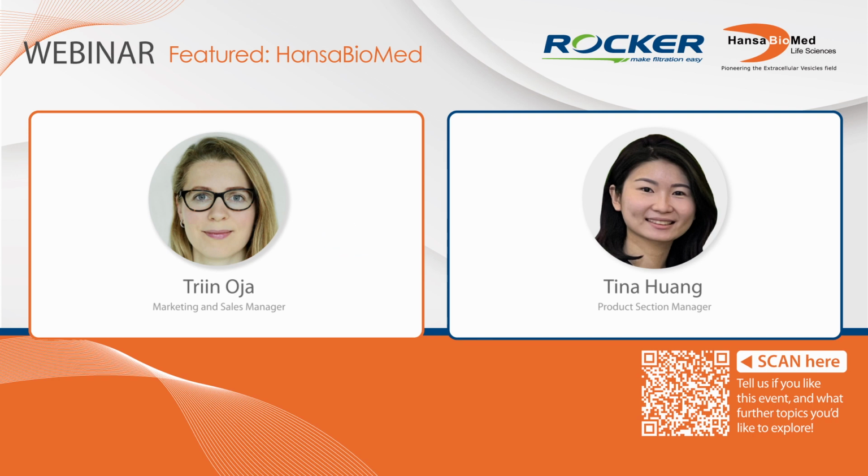Okay, yes. Thanks. And the other question is about the new gold standard being TFF combined with SEC, right? My question is, I use the TFF to remove the large particles, large vesicles, and then concentrate to the needed quantity, and then put it into the SEC, right? Did you compare just using the TFF as the purification technique with combining them together? Yes.